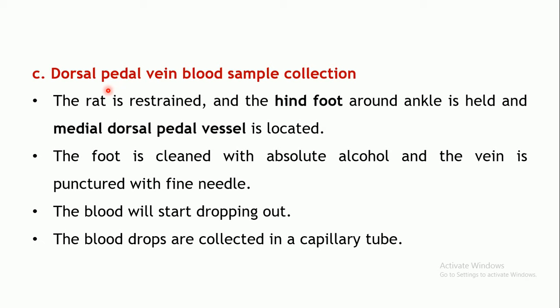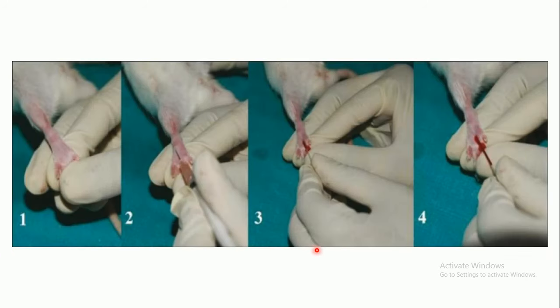The next method is dorsal pedal vein blood sample collection. The rat is restrained, the hind foot around the ankle is held, and the medial dorsal pedal vein is located. The foot is cleaned with absolute alcohol, then the vein is punctured with a fine needle. Blood drops out and is collected in a capillary tube.